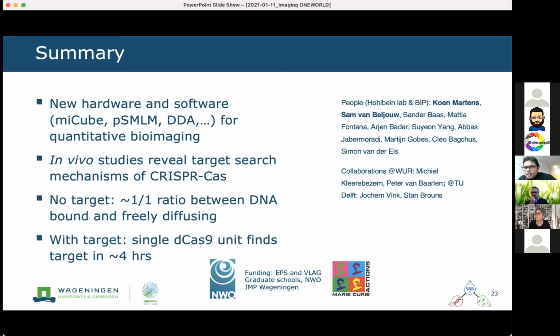So the first question from her is, what are the properties of blinking dyes, proteins, which are most important for this application? Well, this is a very good question. So we used fluorescent proteins because they are genetically encodable. That's one point. We in particular used PAmCherry2, in fact, because it is less prone to blinking. Blinking destroys pretty much your tracks. So that's number one.